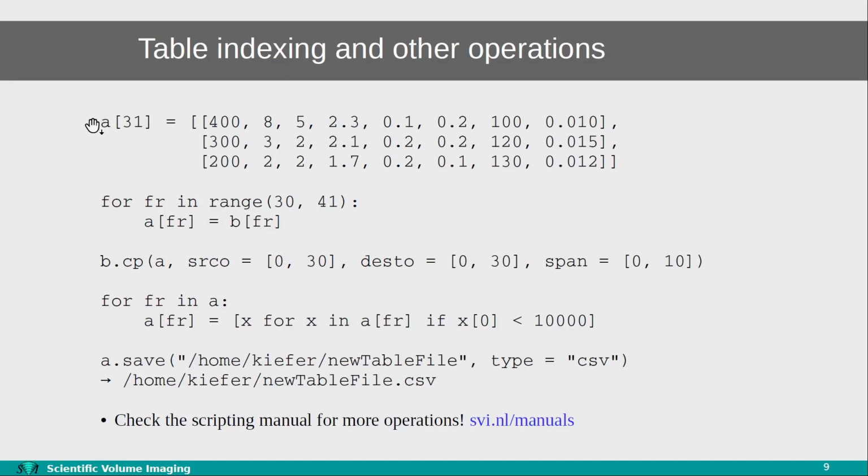Now you can directly access the table values as well. You can simply use your table variable and use either a linear or positional index, just like you can do it for regular images.